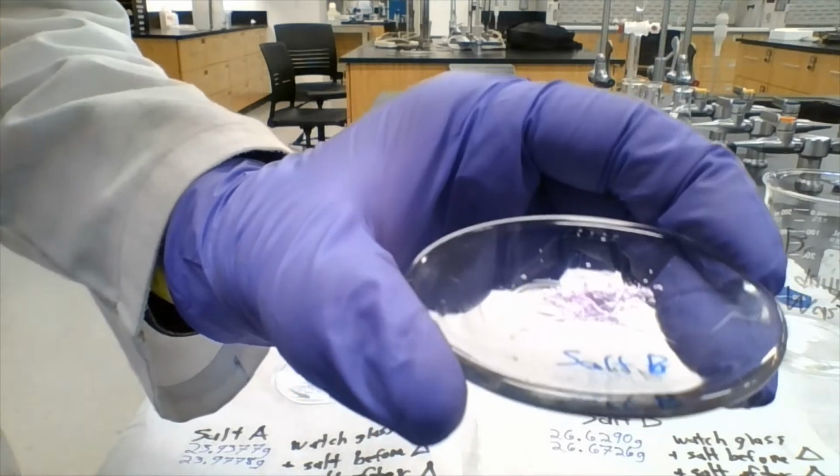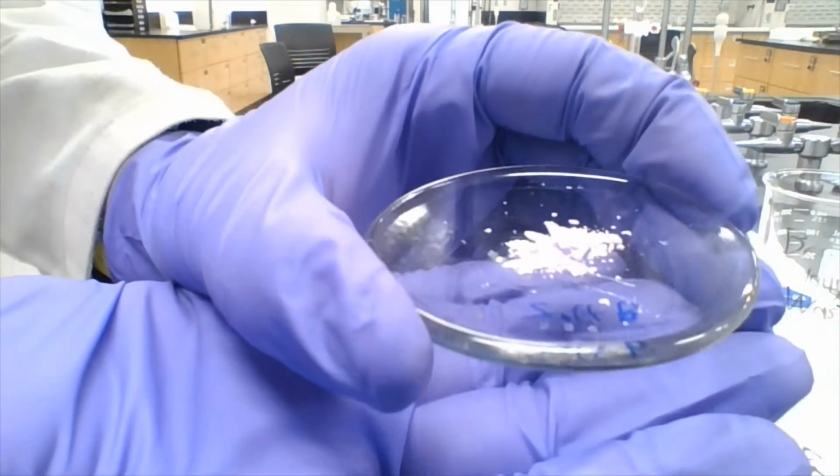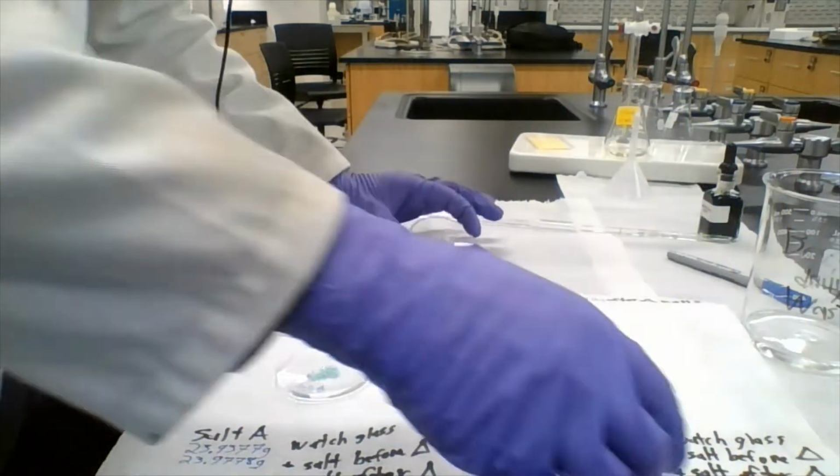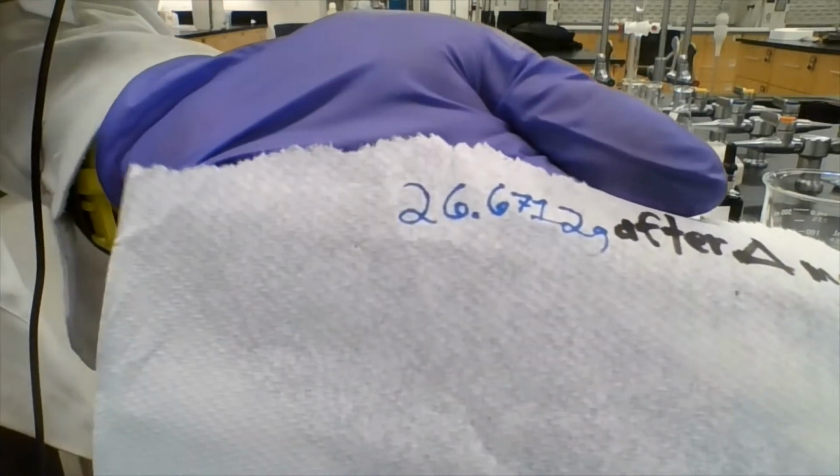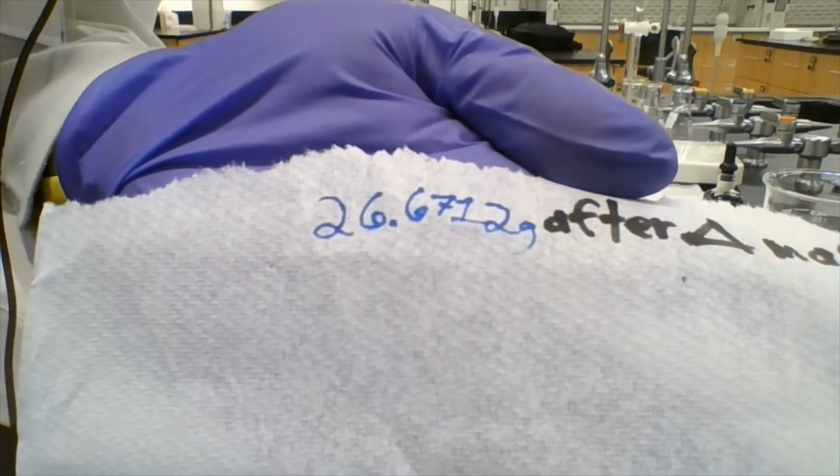Salt B also looks like it is perhaps a slightly lighter shade of whatever it was before. I'm going to guess bluish. Here's the new mass for that.